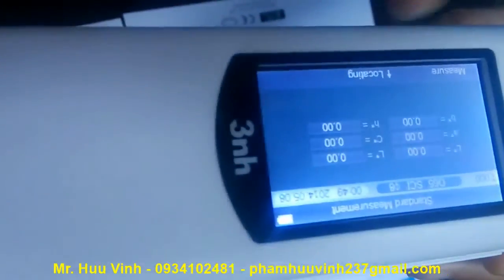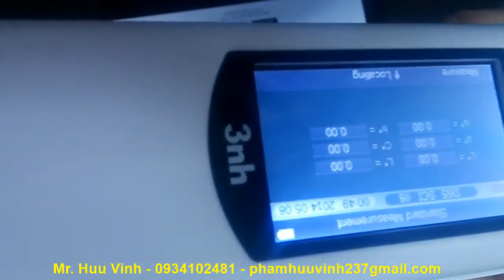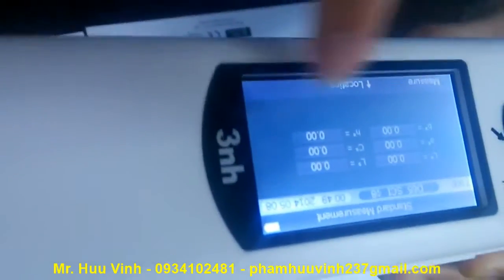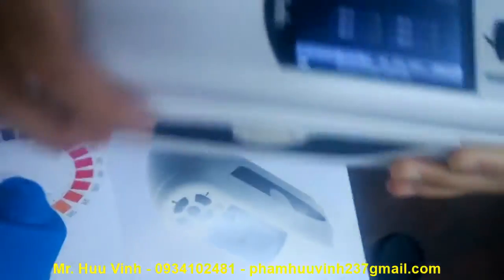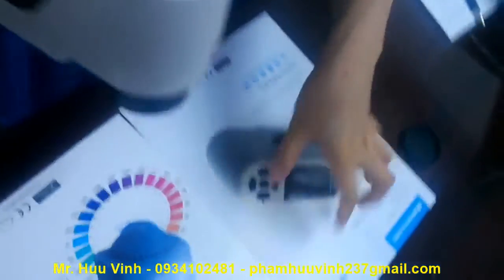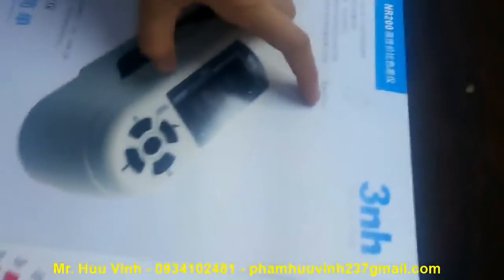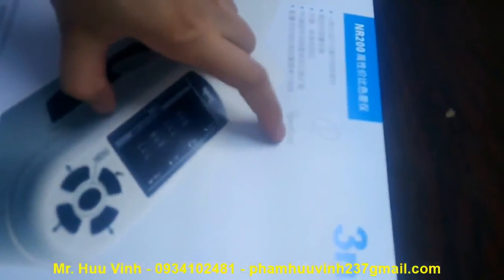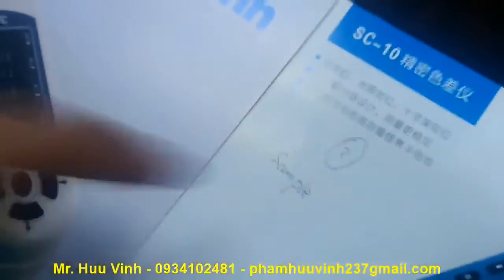We will see the measurement data is zero. Now we take two products: one as the standard product, and another one as the sample.